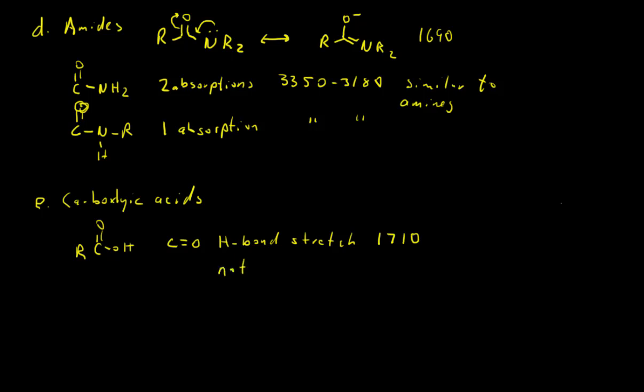If it's not H-bonded, the carbonyl stretch is at higher frequency and it's sharper. So this is about 1760 if it's not, but this is unusual. So this is what you normally see.